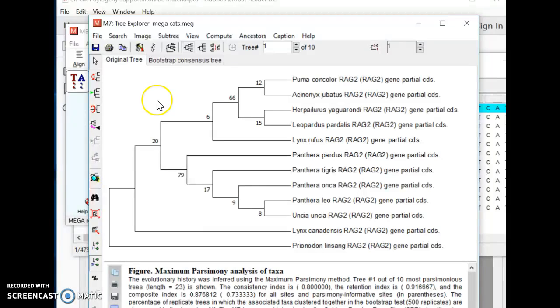And I have different numbers here. These numbers represent what are called bootstrap values. That's a statistical term, a bootstrap. And all we really care about is numbers that are over 50 are going to be significant for us. That's a major group that this tree is very positive about. So numbers over 50, and I can see there's only 2 of them that are the really big numbers.